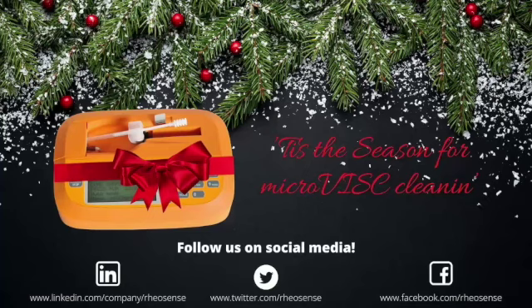All right. Any more questions for us? So some other questions that have rolled in.